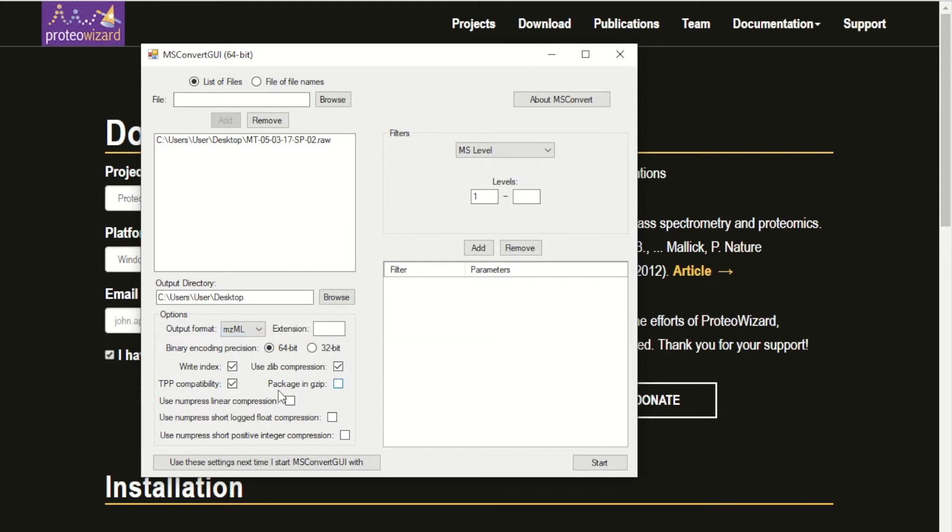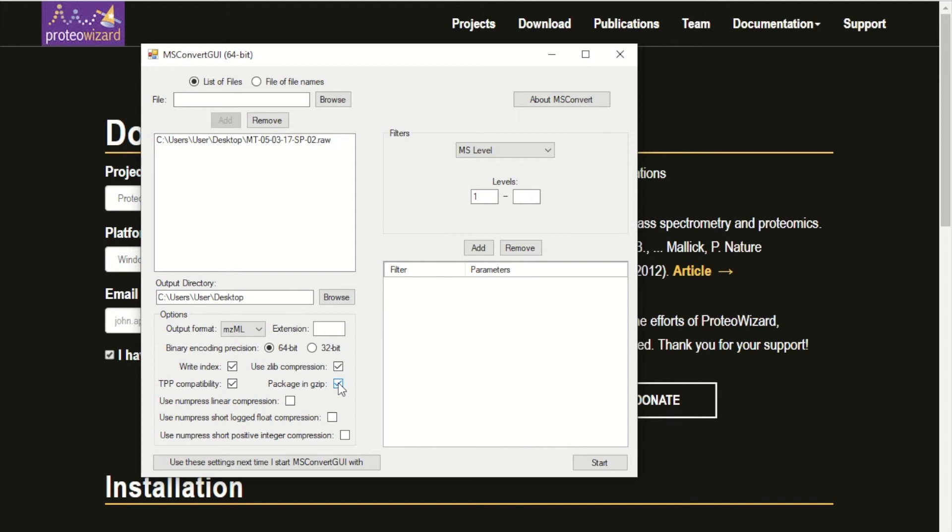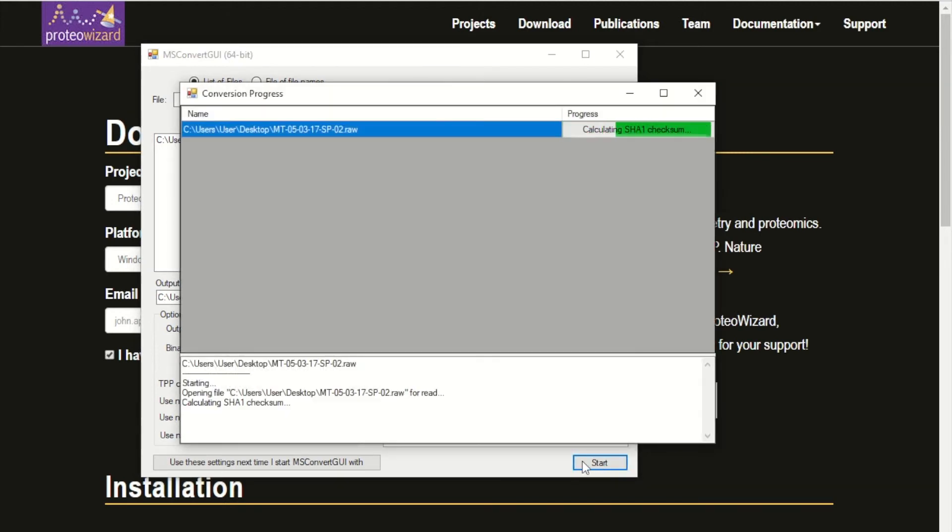You also want to make sure the other boxes are checked, and one more that is 'package in gzip.' Check that box and press start.